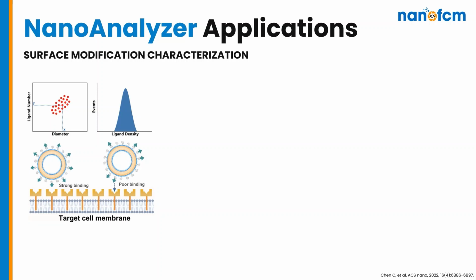And what we want to inspect here is, through using an interactor with that desired molecule, can we detect its presence on the particles just like we're doing with the cargo? What percentage of the particles have it? How bright are they relative to each other? And then in turn, can we determine how many ligands that is?